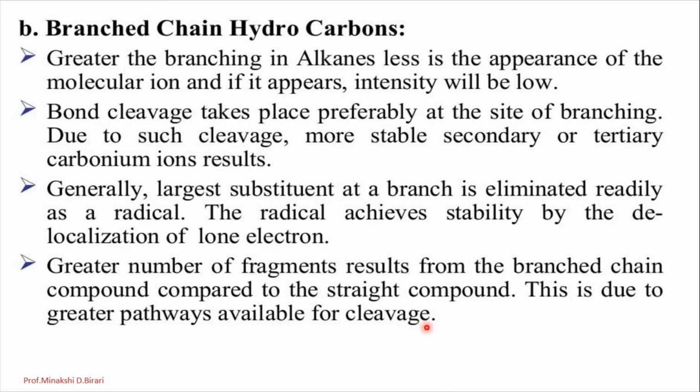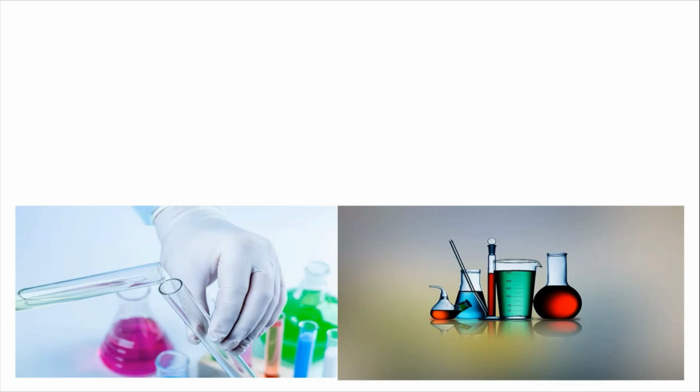So in today's lecture, we have discussed some important rules of fragmentation, like the Stevenson rule, nitrogen rule, even electron rule, and so on. In the next lecture, we will discuss a number of fragmentation patterns with some examples and rules. Thank you.